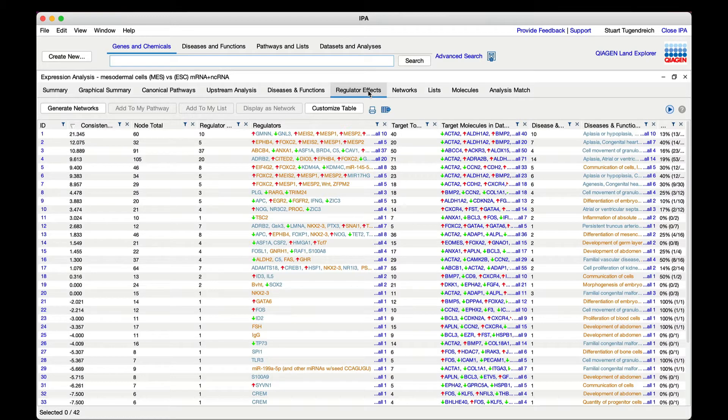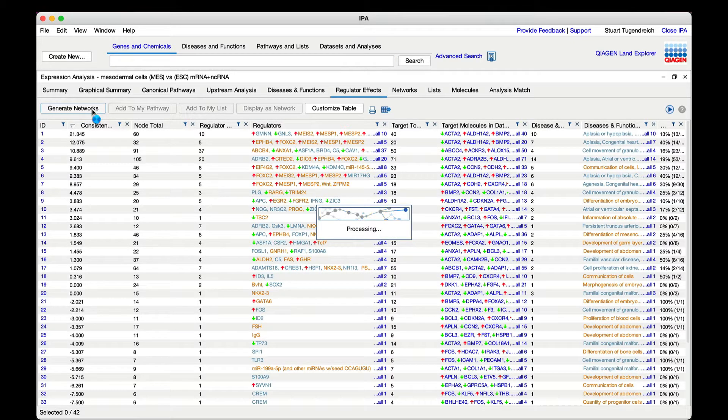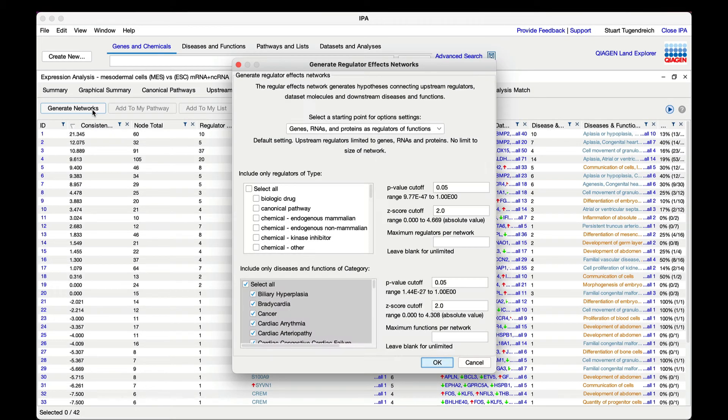Open the mesoderm analysis and click the regulator effects tab. Now click the generate networks button in the toolbar to reconstruct the networks in a different way with a single drug or compound as the upstream regulator in each network.